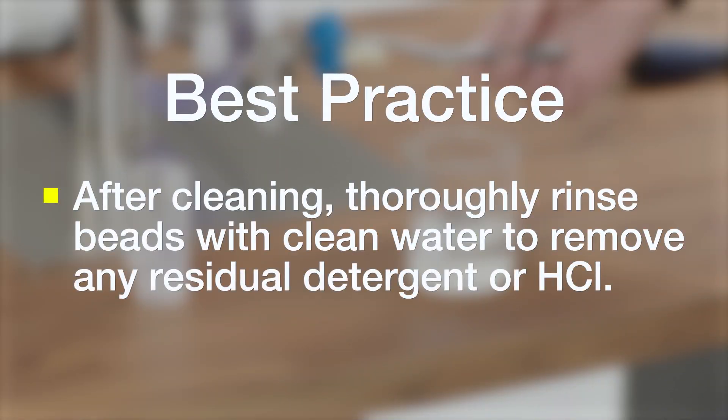Once you are satisfied with how clean the beads are, you will want to rinse them multiple times with clean water to make sure you get rid of either any detergent that's still on them or any HCl on the beads.